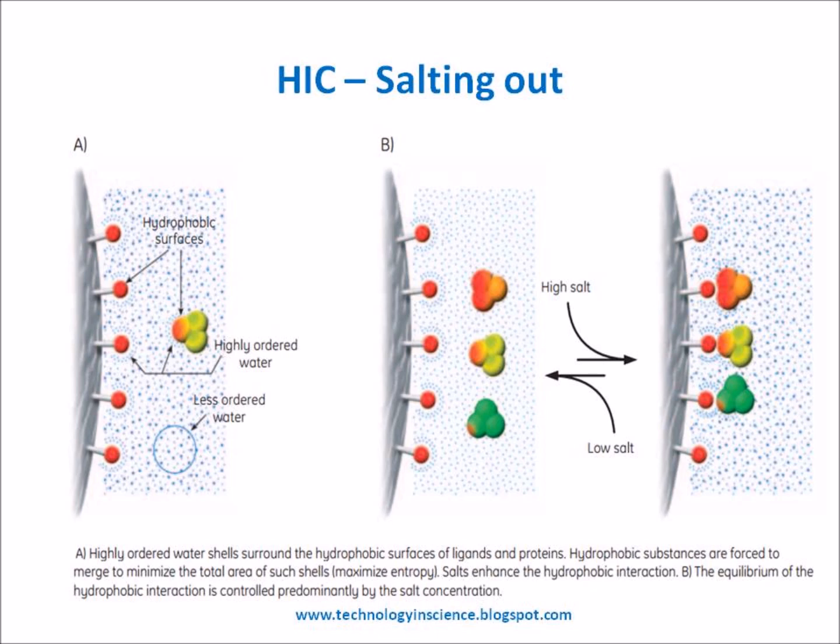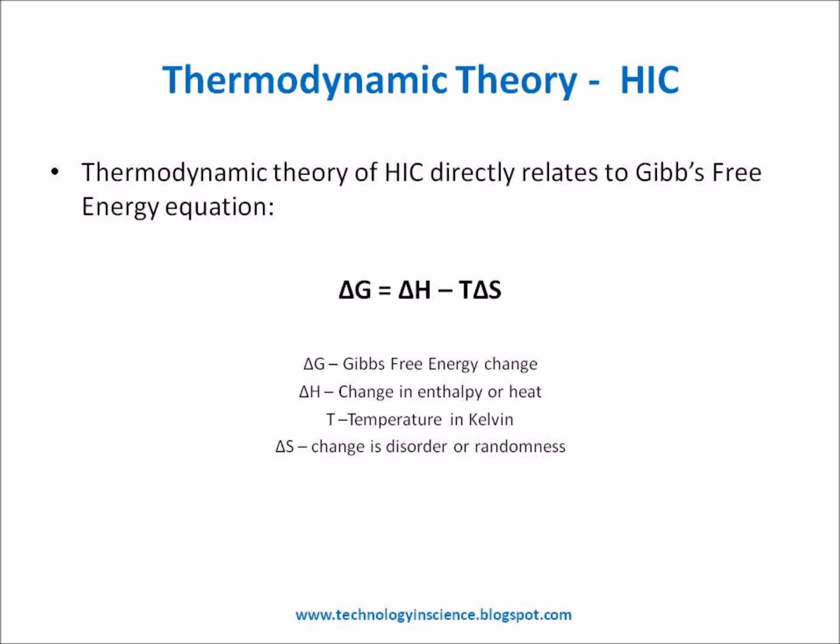Chaotropic agents disrupt the intermolecular forces between water molecules, allowing proteins and other macromolecules to dissolve more easily. Chaotropic agents interfere with stabilizing intramolecular interactions mediated by non-covalent forces, such as hydrogen bonds, van der Waals forces, and hydrophobic effects. Thermodynamics theory. Hydrophobic interaction chromatography.